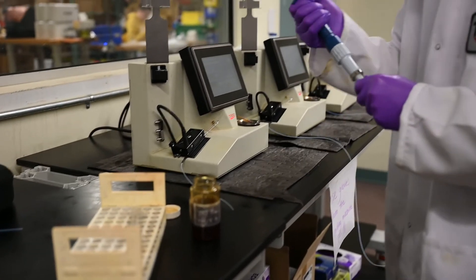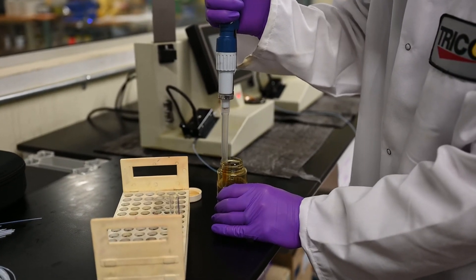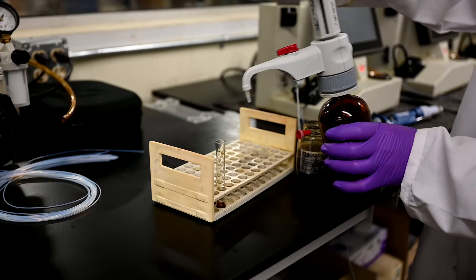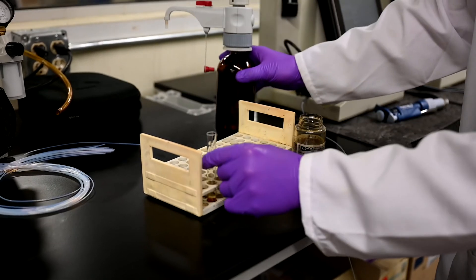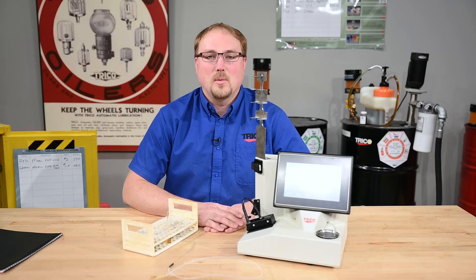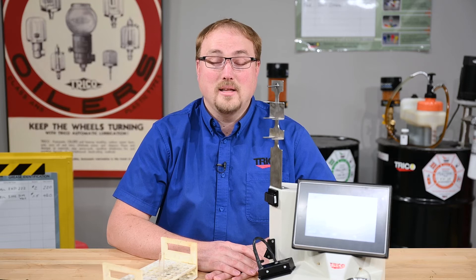We used a pipette dispenser with a pipette tip, placed it into the oil, drew one milliliter of the oil out, and placed it into the sample vial. Then we had our heptane dispenser set up for two milliliters and dispensed two milliliters of heptane into the oil. Then we shook the oil and heptane mixture to obtain our oil sample. Note: this is for demonstration purposes only — when handling chemicals, please follow your company's PPE procedure.